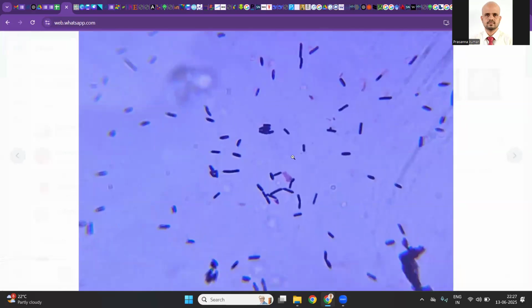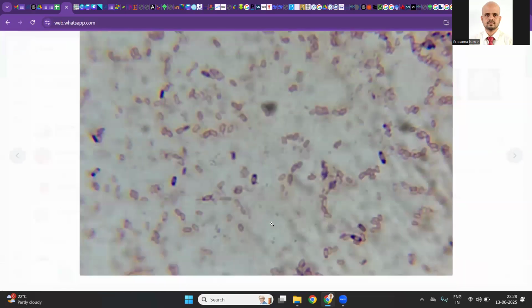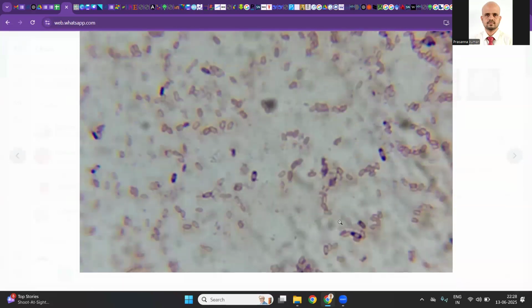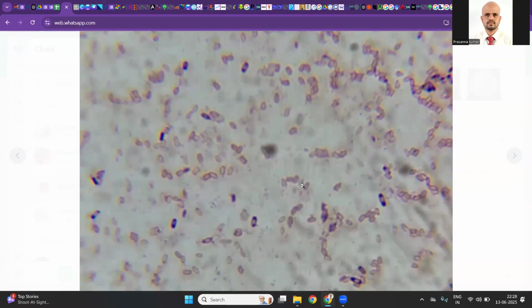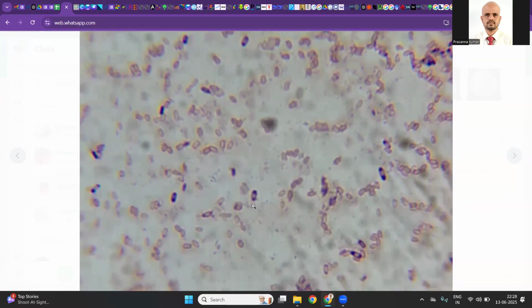Objective is met, individual cells are very clearly captured, but the contrast should be increased. Here, this is not a contamination. Many microbiology students will presume that this might be a contamination, but it is not. You see, whichever cell has been spongily stained or weakly stained is actually an endospore. I should call them exospores because they don't have a vegetative structure now. So these are exospores. The endospore-forming vegetative cells are here.